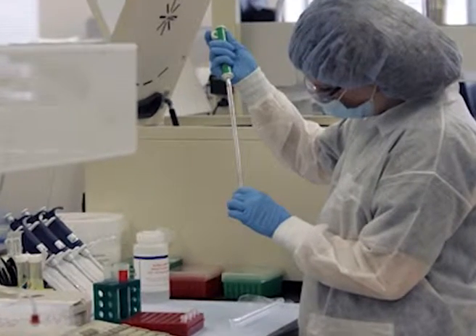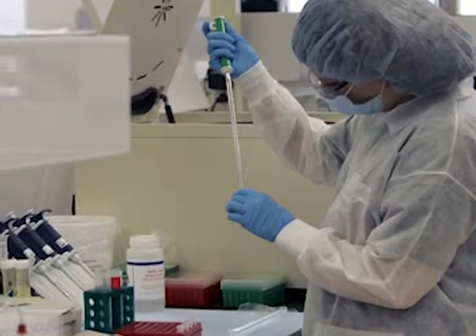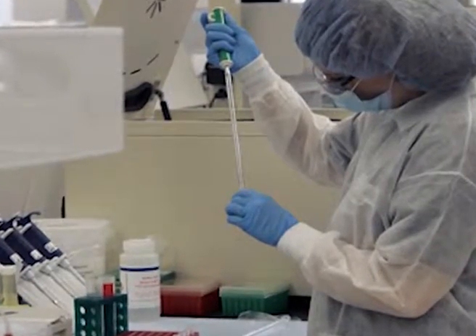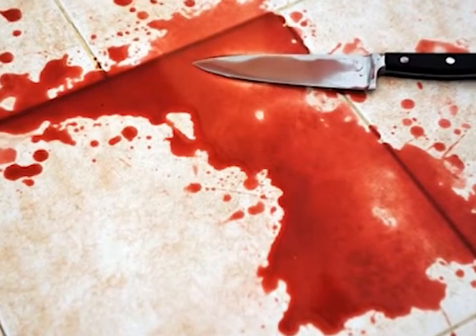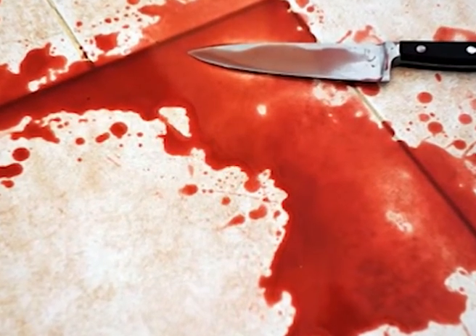When fingerprints impinged on a blood-stained article are to be detected, the method of choice depends on the nature of the surface and, more importantly, on the state of the coagulated blood. The nature of surface also plays a very important role, because if it is an absorbent surface, the blood, rather than forming a print, will seep down into the surface, whereas clearer prints will be obtained on non-porous surfaces. The next factor is the state of the coagulated blood.